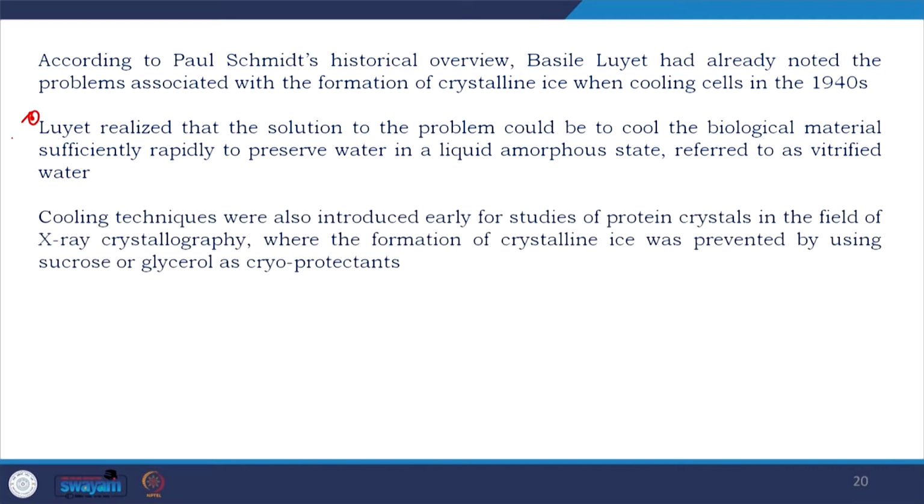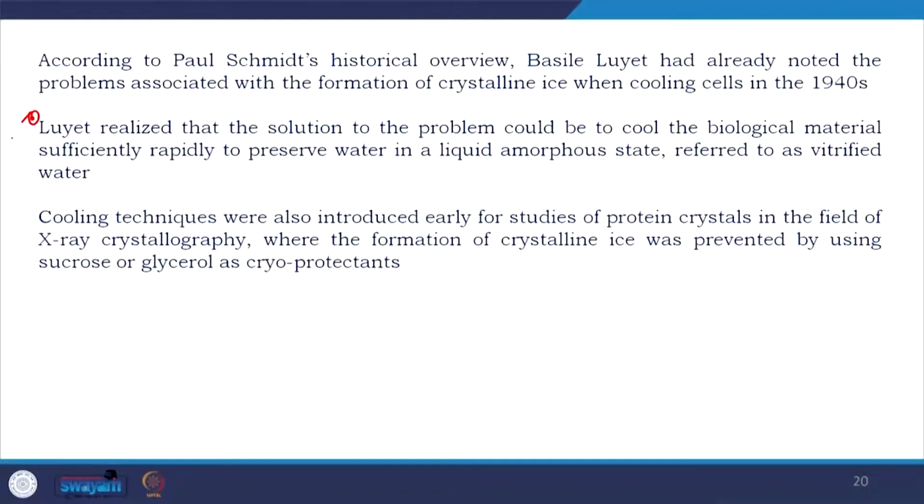solution. Cooling techniques were also introduced early for studies of protein crystal in the field of X-ray crystallography. So, if you see, the cooling and freezing techniques are very similar in protein crystallography and cryo-electron microscopy, where the formation of crystalline ice was prevented by using sucrose or glycerol as a cryoprotectant. So, we still use that when you are freezing the crystal, right.